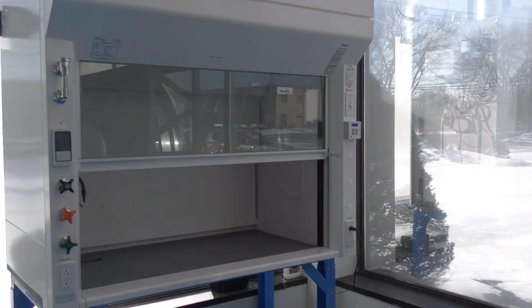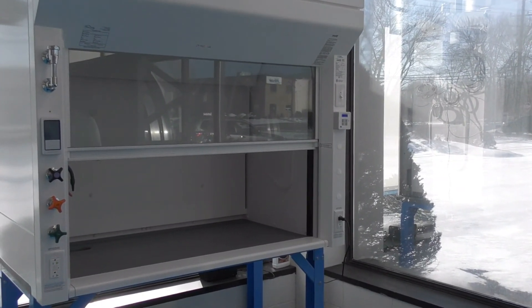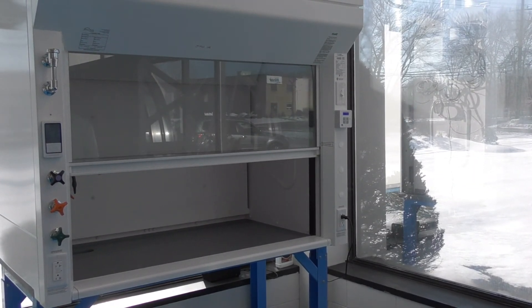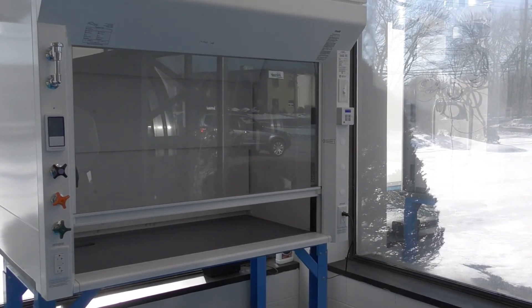The TEL system, as long as it detects nobody in front of the fume hood, will start a countdown. We have our countdown set to 30 seconds, and then an alarm will go off saying the TEL system is closing the fume hood. As you can see, the fume hood sash is now automatically closing.